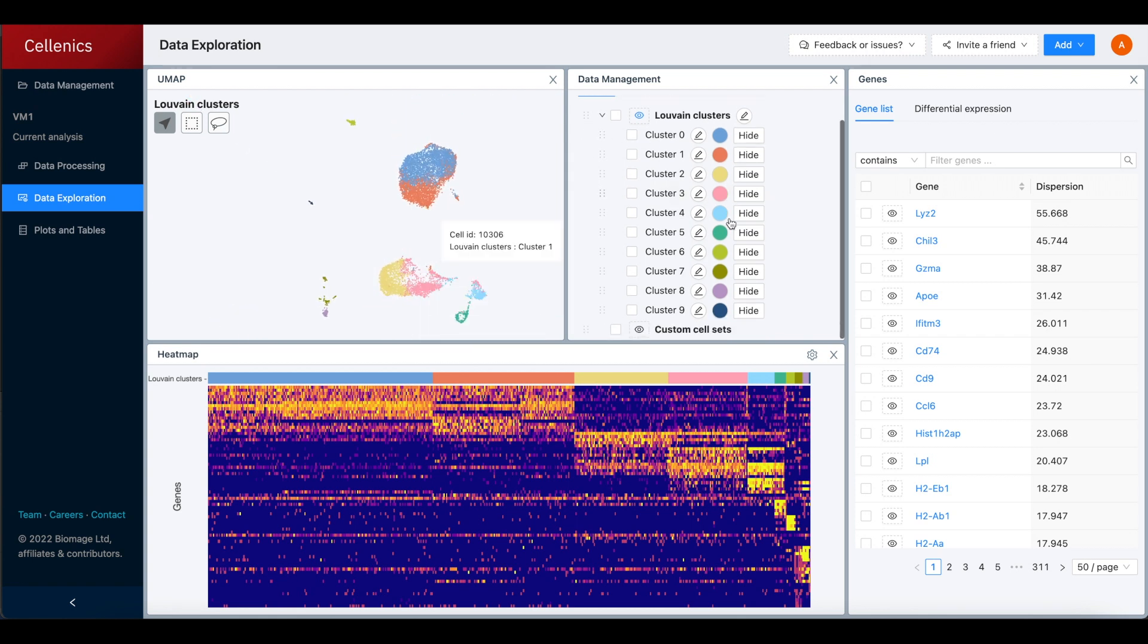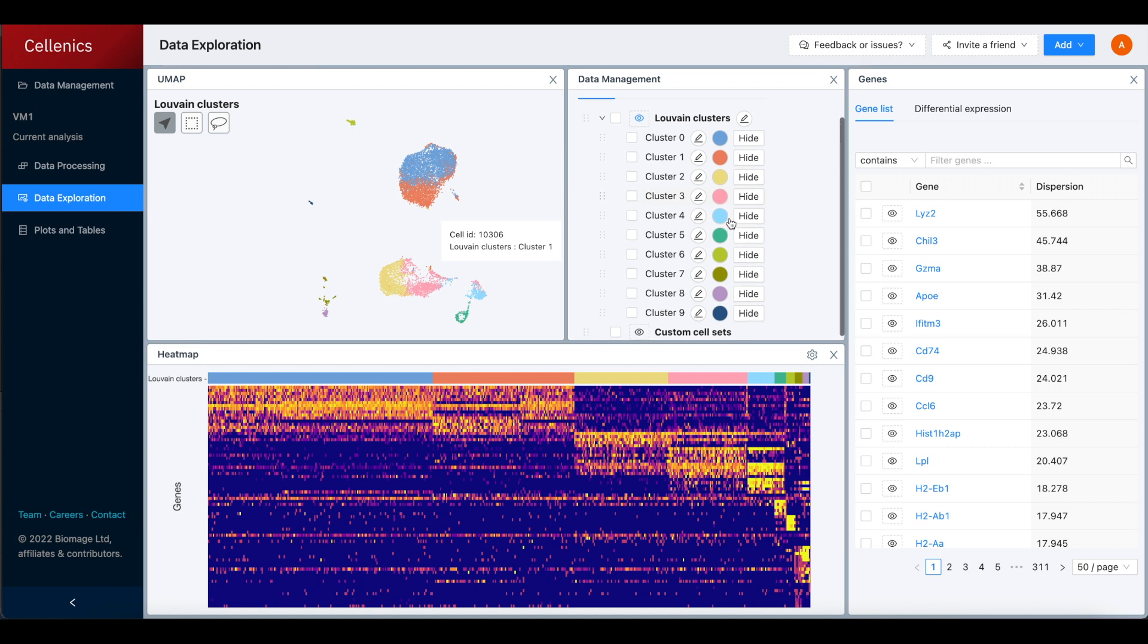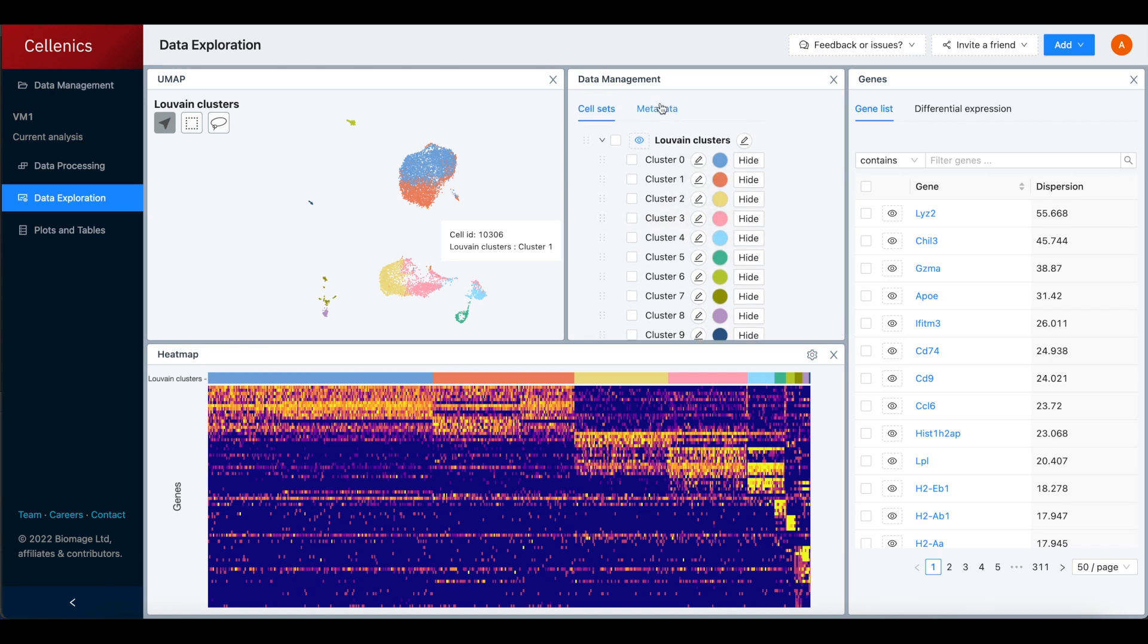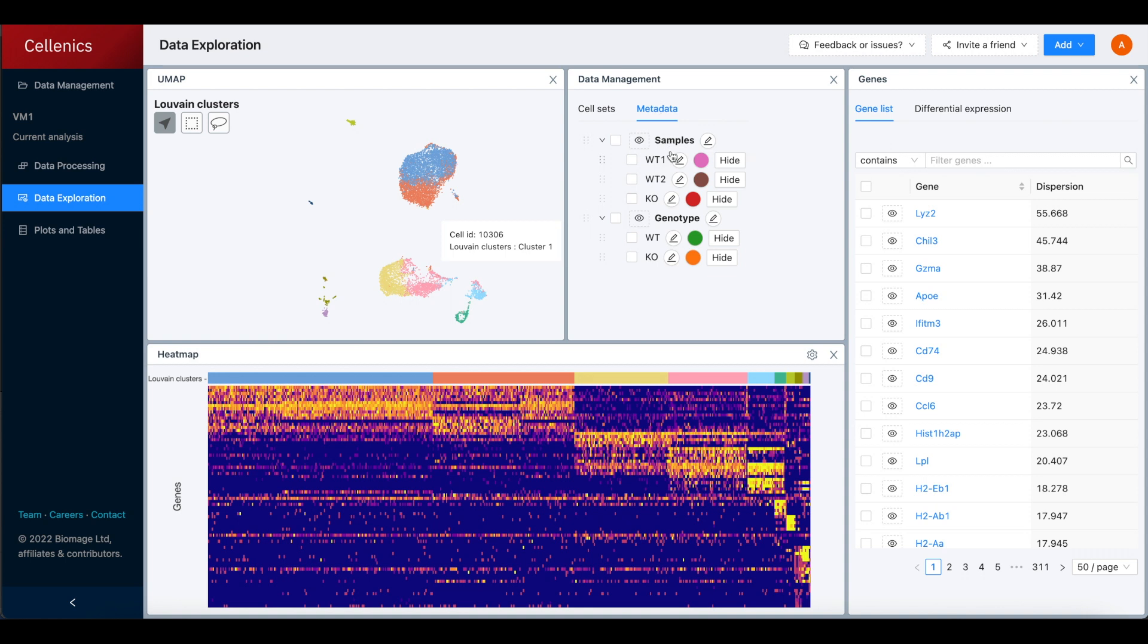In the middle, we have the list of Louvain clusters and any custom cell sets that have been created, as well as the list of samples and metadata.